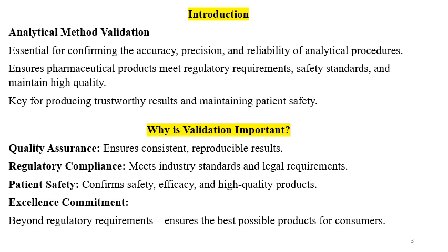Validation is important for quality assurance, regulatory compliance, patient safety, and excellence commitment. Based on the analytical testing, the product is released into the market for use by the patients for disease treatment. And think that if the analytical method is not proper, what will happen? Sometimes a defective product, a faulty product, or a failed product gets released into the market. So for quality assurance, validations are important.